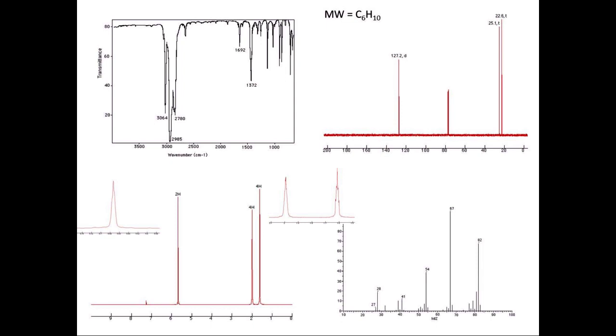Now we could draw more and more options with smaller ring sizes, but if we start here, we might get an idea that we don't need to go any smaller. So let's start by looking at this molecule. What we see is unique number of carbons. We have carbon A here, carbon A here, carbon B, carbon B, carbon C, carbon D. 1, 2, 3, 4 unique types of carbon. We should see 4 signals in the carbon NMR, and we don't, so we can immediately eliminate this.